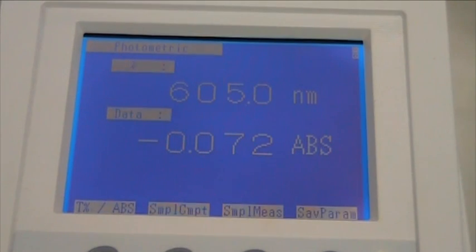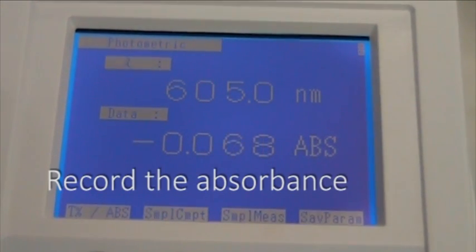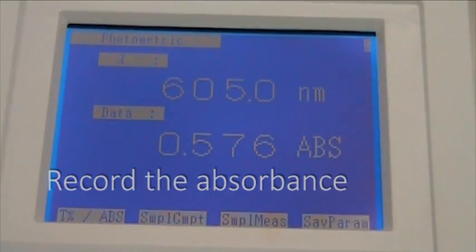The absorbance will be determined automatically and displayed on the screen. There is no need to press any more buttons, just record the absorbance into your notebook.